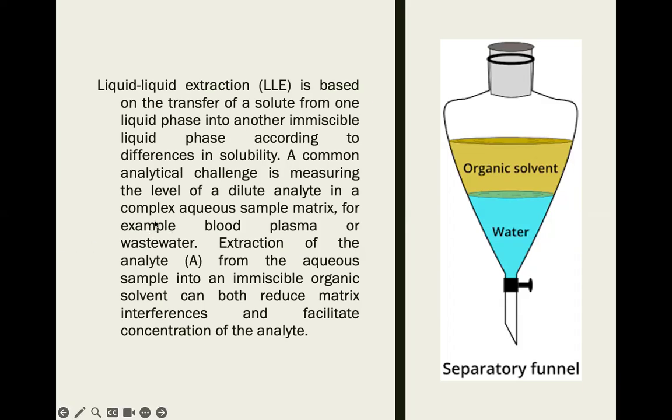And the river water is a complex sample matrix. When you scoop the river water, you're gonna have other things as well. Okay, same goes for body liquid. So how do you play with that? This is the purpose of having separation techniques. In this case, particularly, we are talking about extraction.